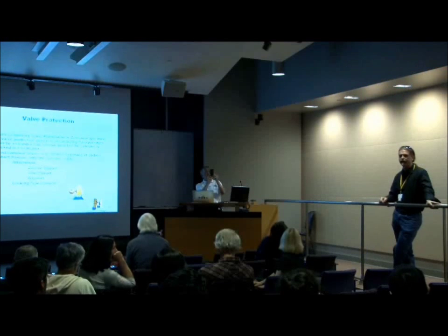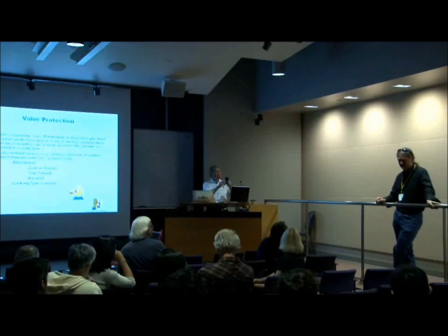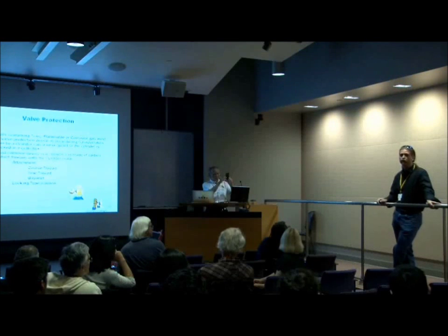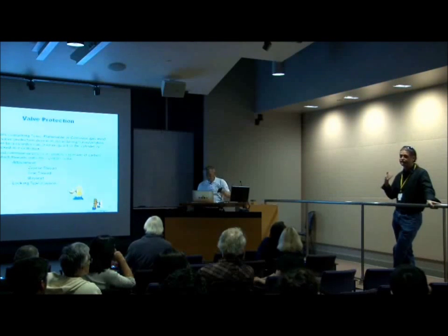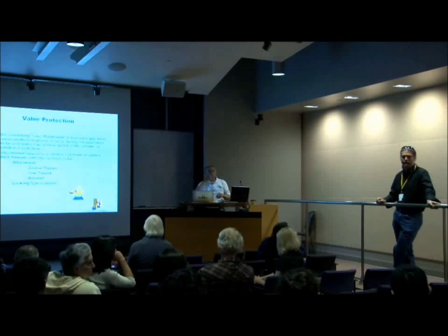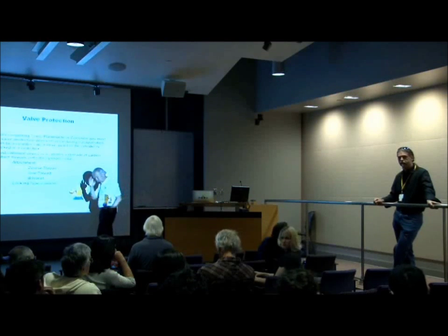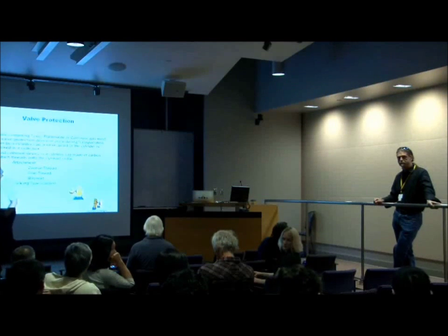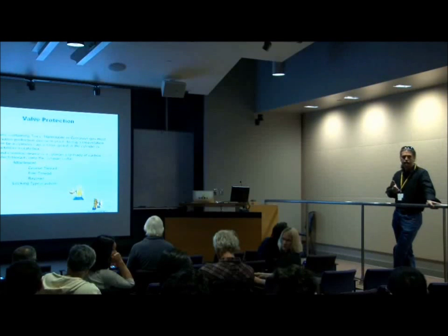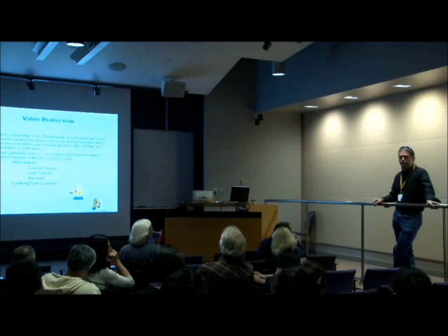Does it mean that we can't work with a lab if they've got high-value gas? We go possibly past that date? No. But we do encourage you to start pushing those out because we don't want to have an issue with them. And I've actually called the vendors and they say, yes, we need to go back. Yeah, I think that's the concern. If you have a high value cylinder, it's not refillable, but it's still in working order, and you're still using it. How reasonable is it? What's that time frame? We have to get rid of that.